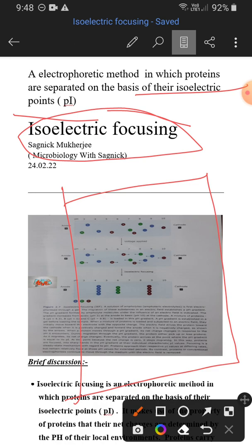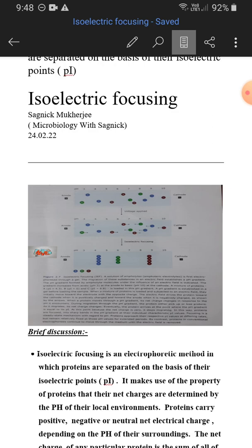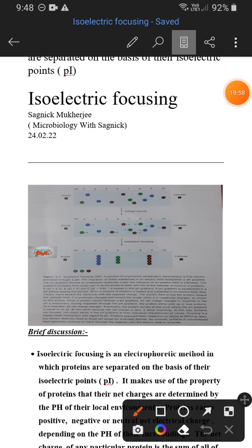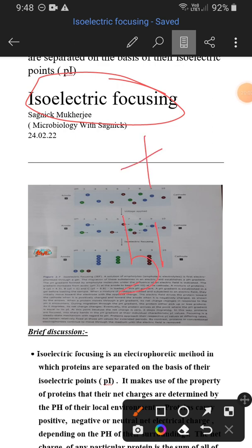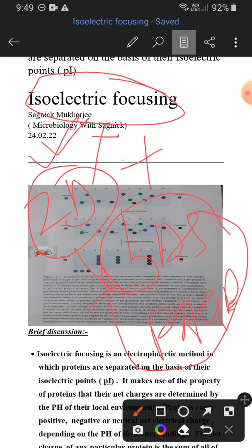We have another important gel electrophoresis technique that I am going to discuss with you some other day, that is SDS-PAGE. We are just attaching isoelectric focusing along with SDS-PAGE to increase the resolution. So these two separation techniques together are called 2D gel electrophoresis. That means here we are taking two physical properties together under consideration. One is isoelectric focusing and the other one is SDS-PAGE. That is why the name 2D. We are going to discuss this some other day.